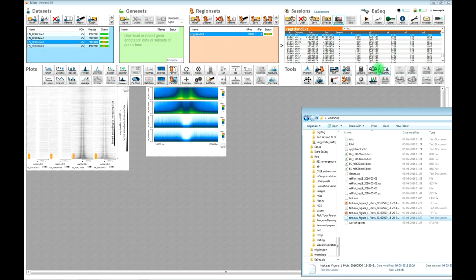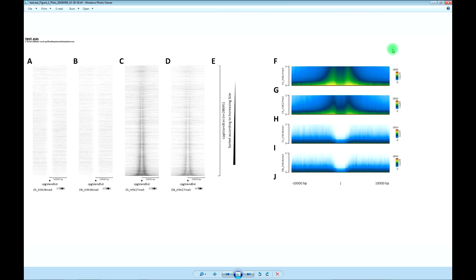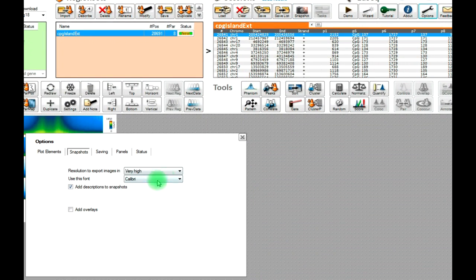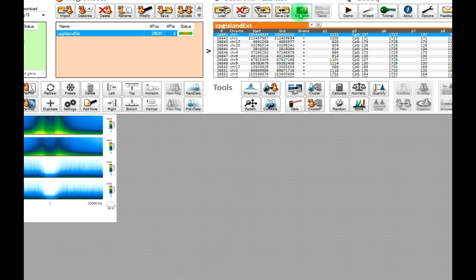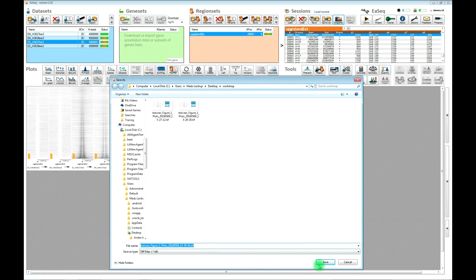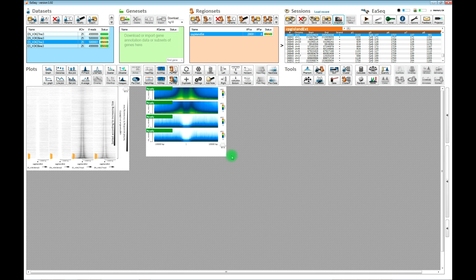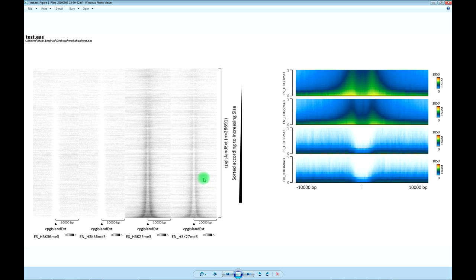If you don't want EASEQ to add the spacing between plots and these auto-enumerations, then you can go into Options and uncheck 'Add descriptions to snapshots.' Then if you make a new snapshot, EASEQ will no longer add the automatic enumeration and the panels will be more tightly put together.